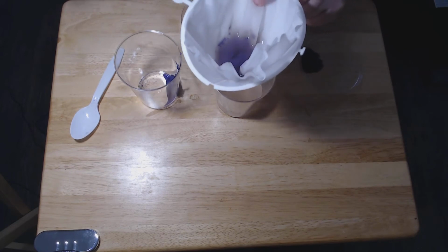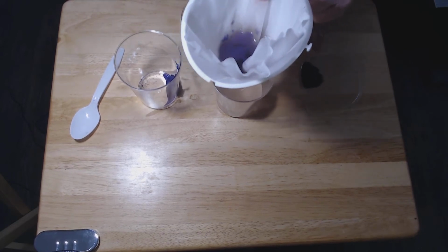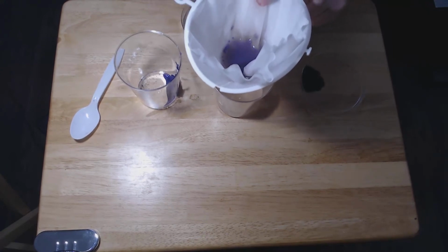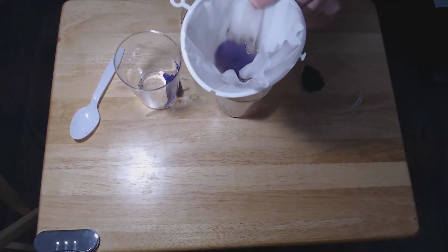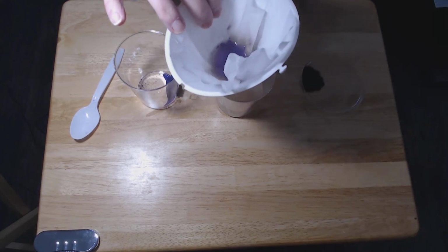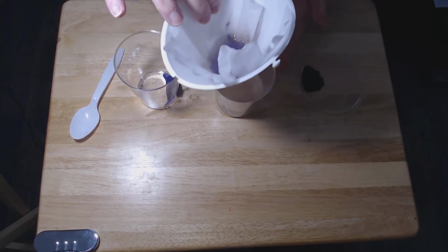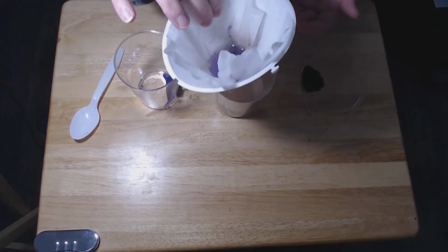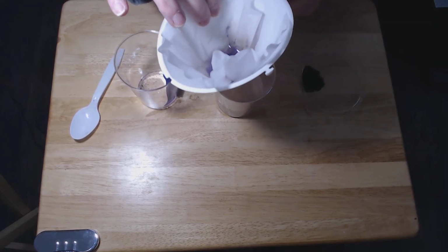What I'm going to end up with is the iron in the dish. I'm going to end up with the salt in the water, and I'm going to end up with the sand in the coffee filter. Now, the salt is mixed with the water. We have created a mixture of salt water.